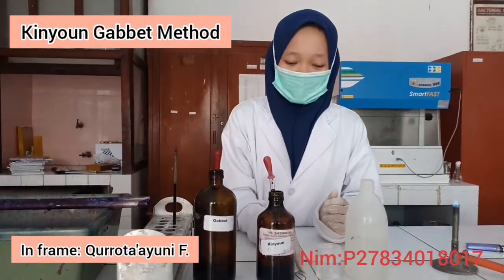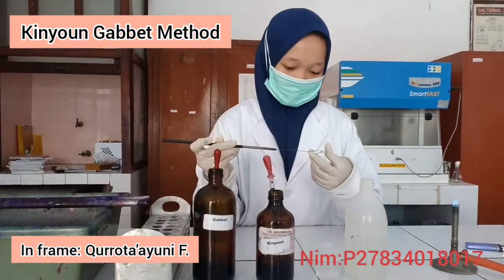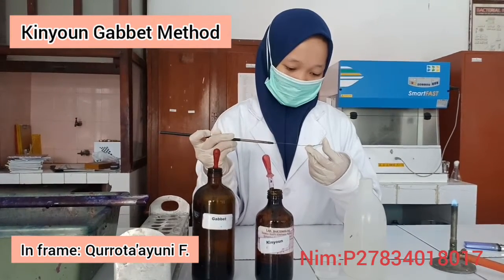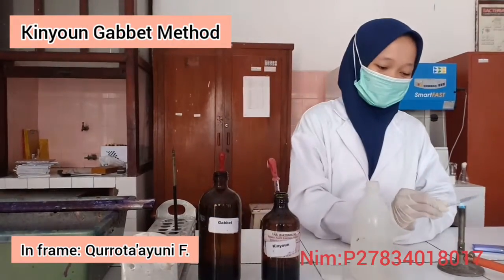And now I will make a preparation of bacteria. And then fixation again.